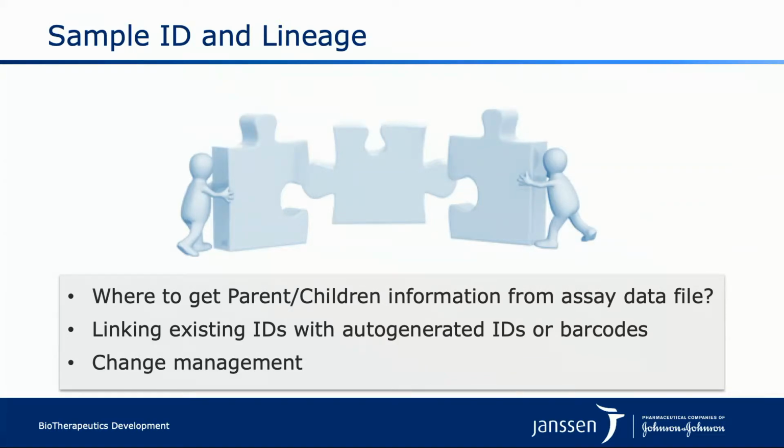We're not trying to say, we generated a 96 well plate, it's number 1, and that goes to the next stage, which is number 21, or number 1023. That's not practical and is error-prone for the scientists to use in their daily operation.